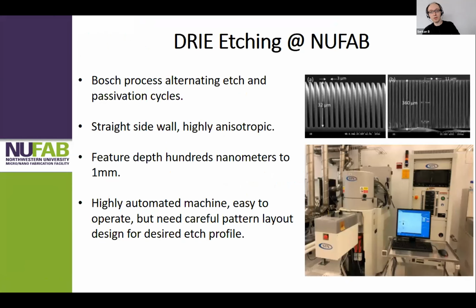All right, so how we use the deep RIE to make the silicon molds for PDMS casting. And then I'll talk about the new kid on the block, our laser ablation machine, which is highly productive if you need to do some basic microfluidic devices with large feature sizes.